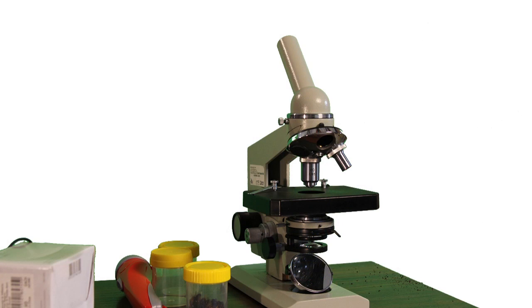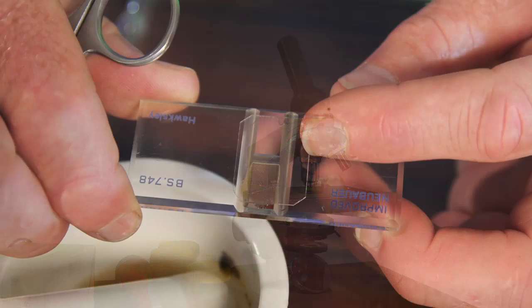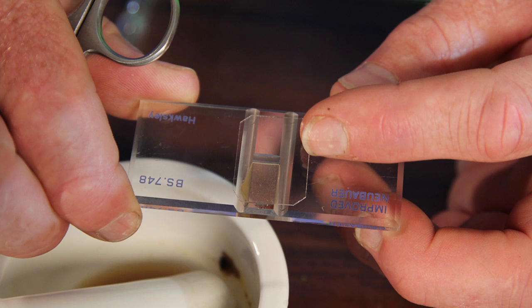All they need is a microscope with a 300 power amplification. They need a counting chamber, or this is called a haemocytometer.